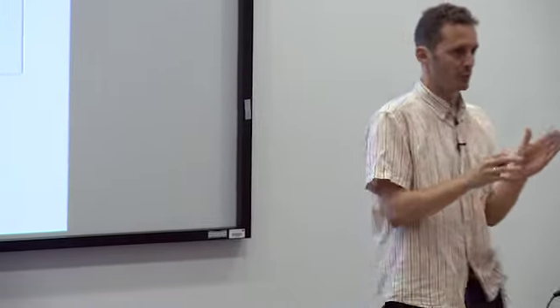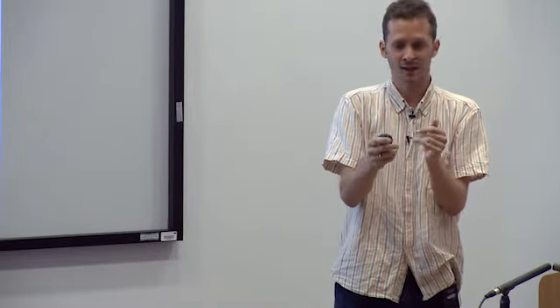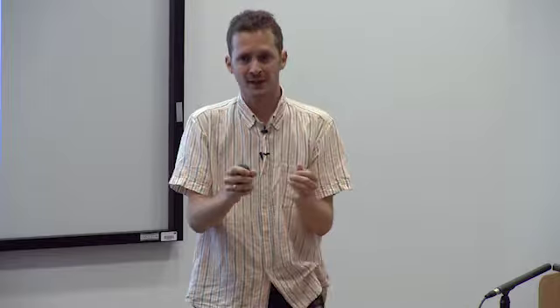The images have nothing to do anymore with this orange puppet that we started with. Yet, the reconstruction that comes out is somewhat of a mixture of the two. And that is because all the orientations that we have assigned were based on comparisons with the orange reference projections.